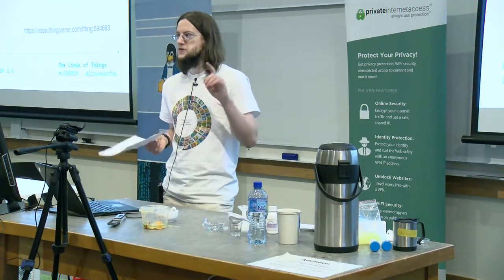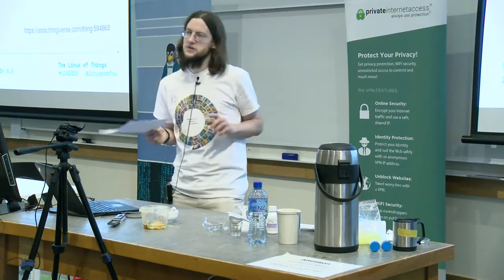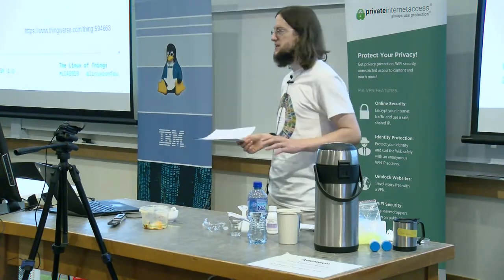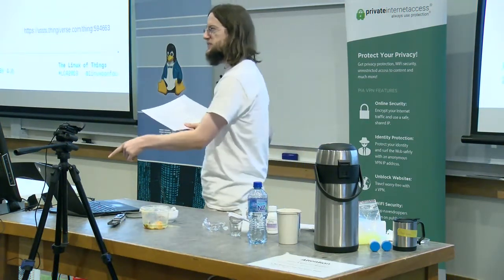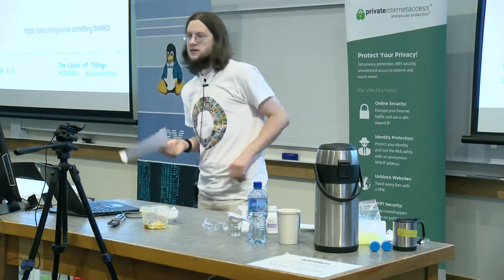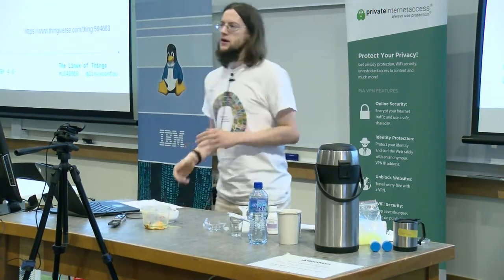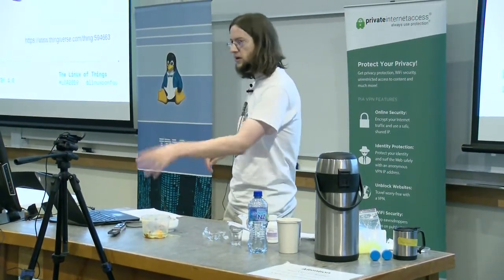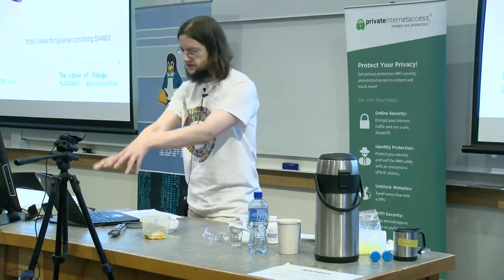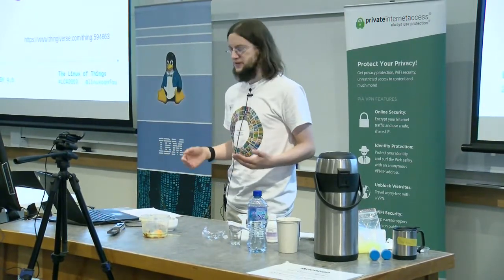Now, for those who haven't read my abstract, what I'm going to do is attempt a full workflow of DNA sequencing, from food to figures. In preparation for this, before I started my talk today, I prepared this flow cell that's sitting right here on the DNA sequencer and warmed it up a bit.